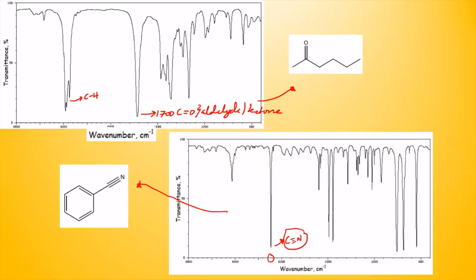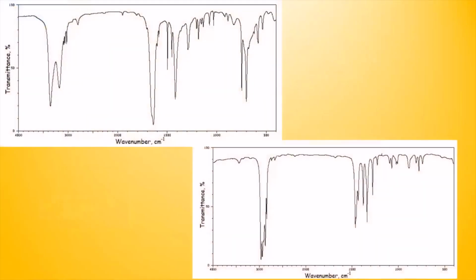So one way for me to ask this on a test is I give you a spectrum. Maybe I give you values and ask, which of these would be a correct statement? This value corresponds to this. That's one way. Or I can give you which peaks can be obtained from it. I will not give you close calls. You see, all of these are so close. There may be some commonality. So I won't dig deep into all these close looking peaks on this side. There are so many close calls here. I wouldn't put you in that spot. I would only go for the key markers that allow you to identify one molecule from the other. I got one more. Here we go.